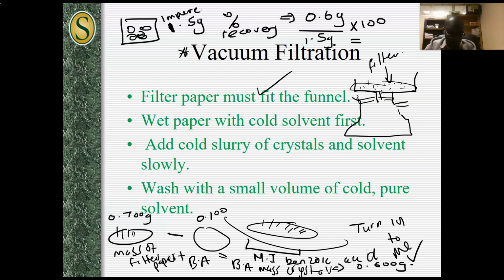So I'm getting the answer to be 40%. So that will be 40% recovery. Now the question is, is that a good recovery? We don't know how much Jerry had put in there, so to me that's fine. I would say let your answer be as close to 50% as possible. A recovery of 15% is poor recovery. You lose points on that.